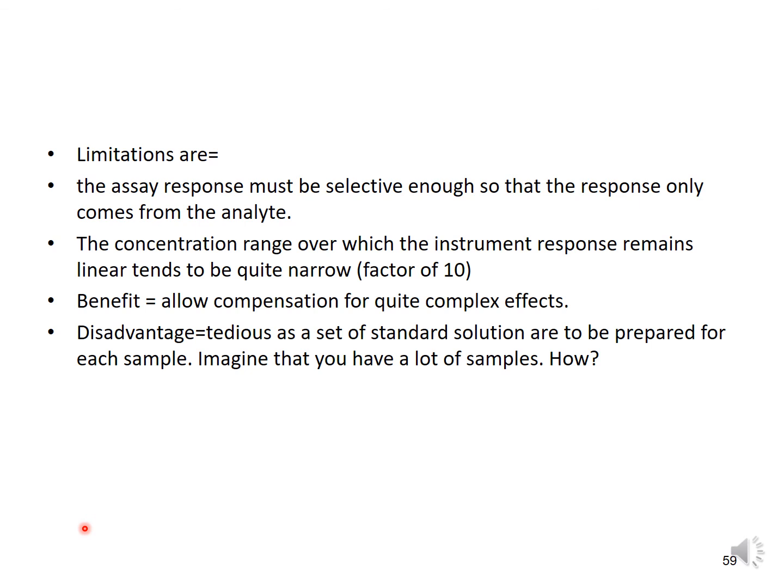So you need to think, what about if you have lots of samples? This is the tedious thing that you need to think about if you want to prepare a set of standard solutions.